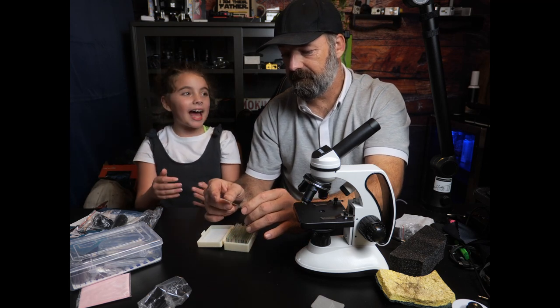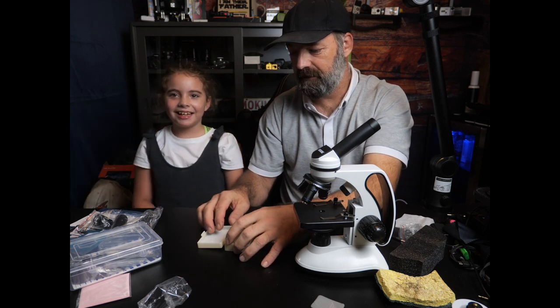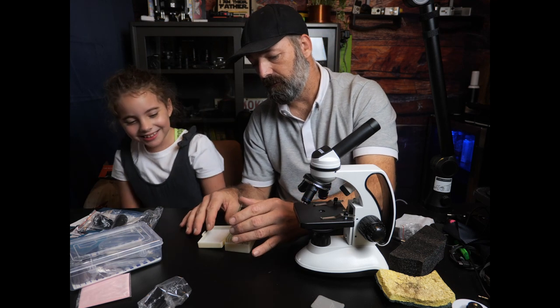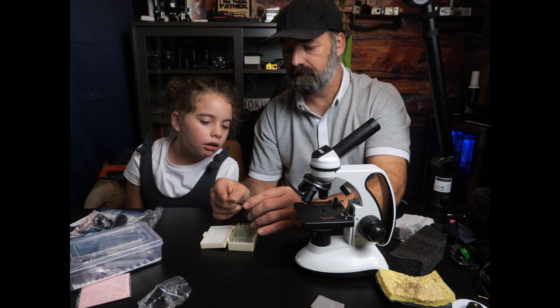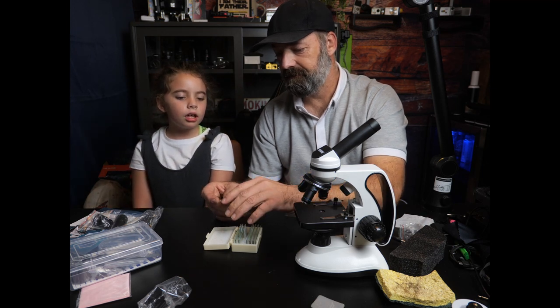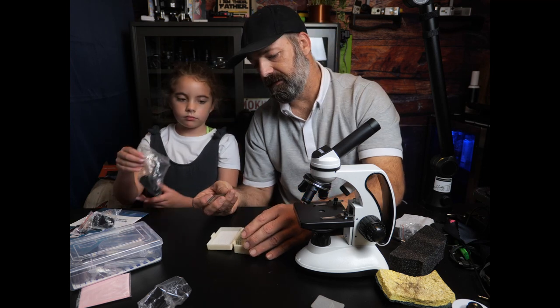I didn't even know that bees have legs! This is human blood — now that's just creepy. Who's the guy in the factory giving up all his blood? This is a leaf of a hydrilla verticillata, whatever that is. That's why I didn't make it through science in school — I couldn't pronounce the Latin names. This is a seed. A small intestine section. Somebody's guts. Honey bee wings. A pine young staminate cone.